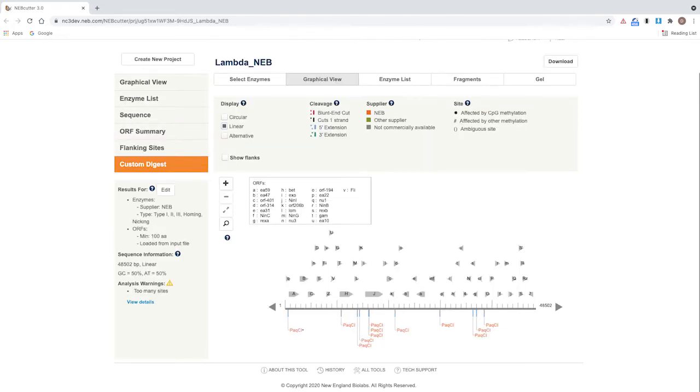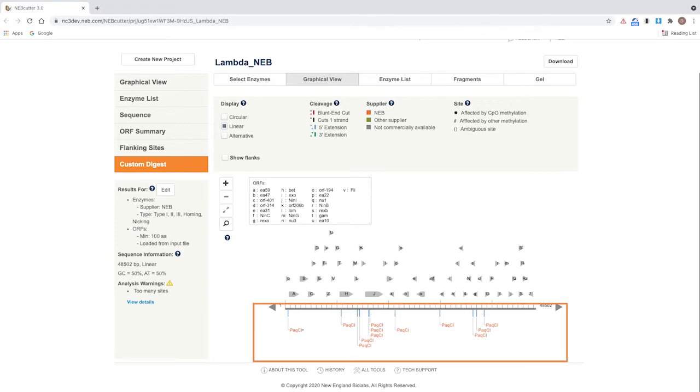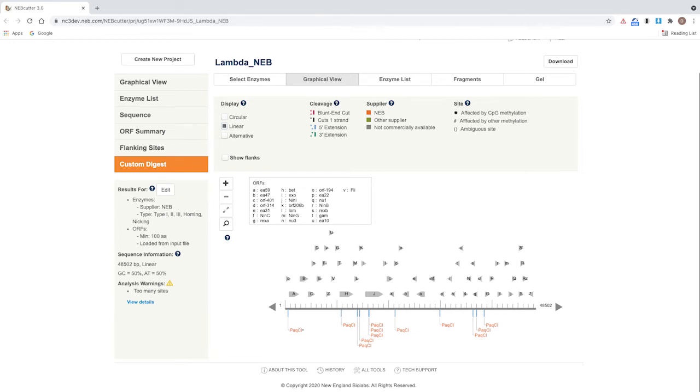NEBcutter displays a map of the sequence with PacI sites displayed. To visualize a gel of this custom digest, click gel.